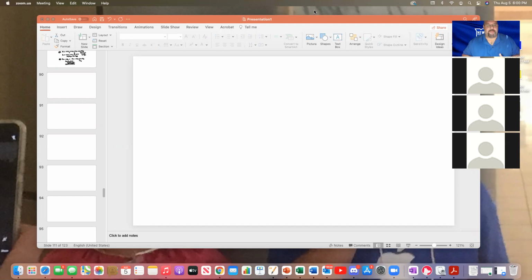So test tube A has tyrosinase, catechol, and water. Test tube B, I believe, has tyrosinase, catechol, and benzoic acid instead of water. And test tube C has tyrosinase, catechol, and resorcinol. So the idea, in a sense, is that in your first test tube you have the enzyme and the substrate, which you should have determined from part 1 that the tyrosinase really reacts with.